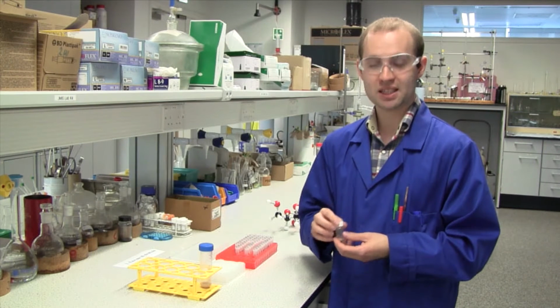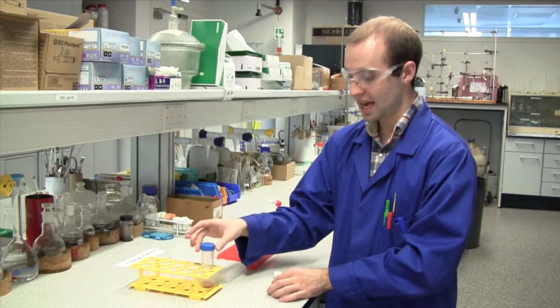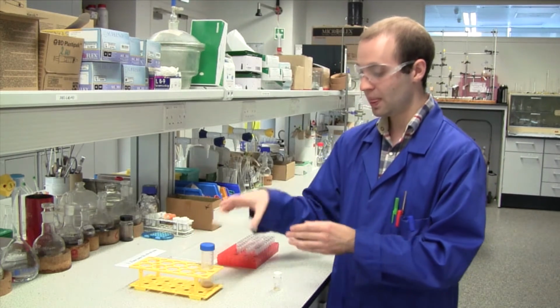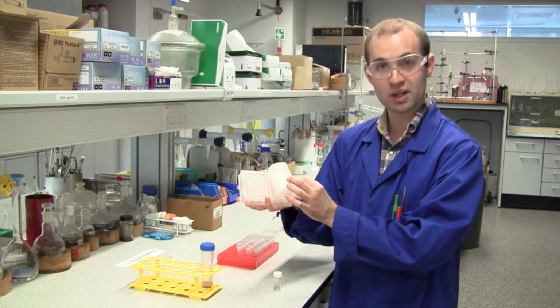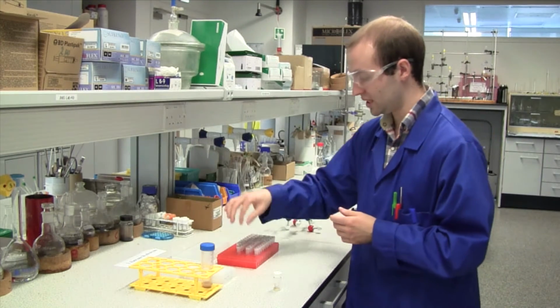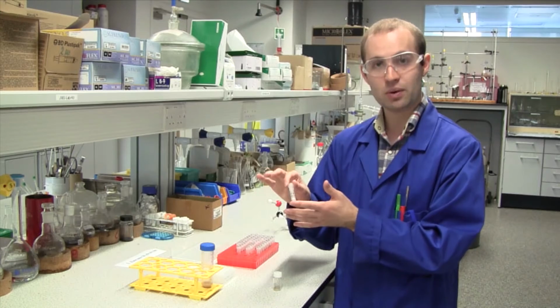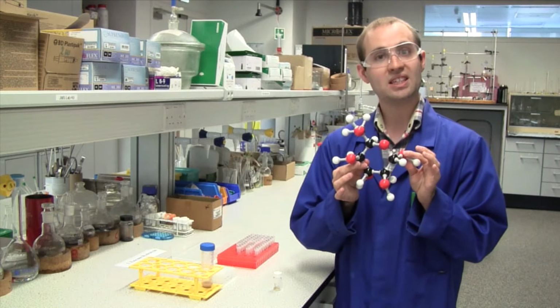Once we've pre-treated our biomass, we're left with a sample that we can now use for enzyme hydrolysis. We can take an enzyme mixture, in this case cellulase enzymes to digest cellulose, and put it either in well plates, as we have here, so we can do lots of samples and lots of replicates to make sure the data we get is accurate, or we can do individual studies by placing them in these vials as such. The enzyme mixture and the biomass is incubated at 50 degrees for 8 hours to hopefully produce large quantities of sugars, in this case glucose.